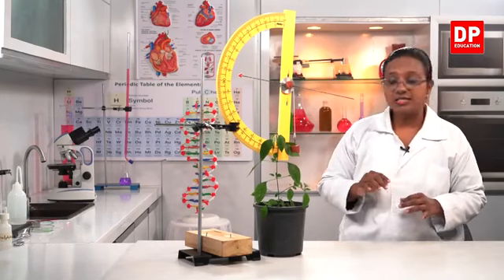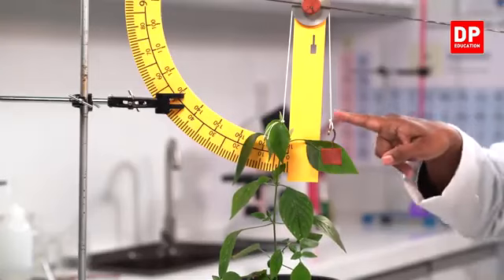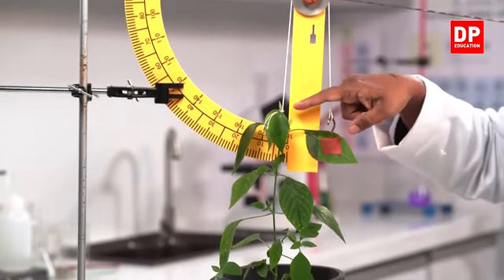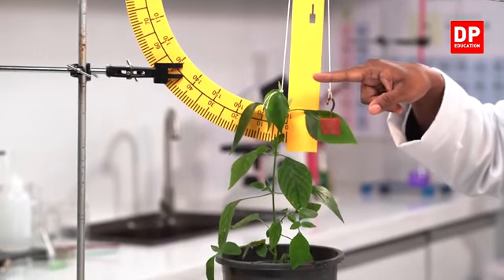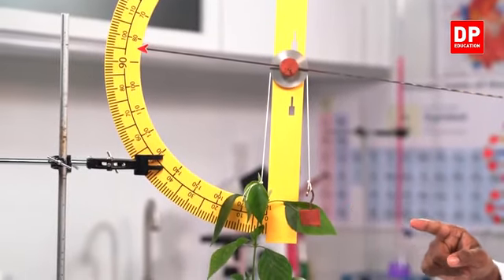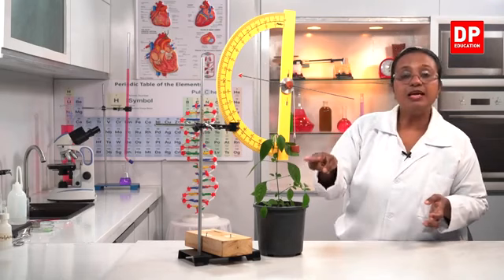Then what do we do? We need to attach the potted plant. Now can you all observe that? Where do you tie the thread? The thread has to be tied to the shoot apex, where I have tied it to the plant. You can observe that clearly. This is the shoot apex of the plant. You have to tie one end of the thread to the shoot apex. You have to send the thread around the pulley, and on the other end of the thread we have to hang a small weight. Now here this is a cork, so that's not very heavy, it's a light thing, so that the plant will be erect.